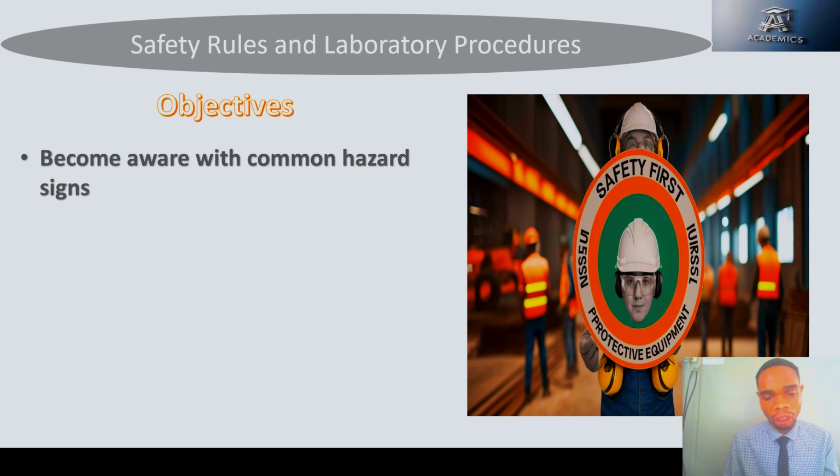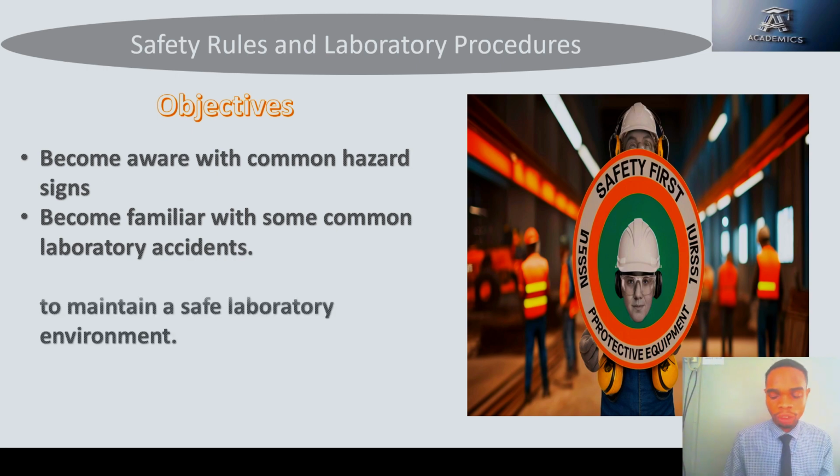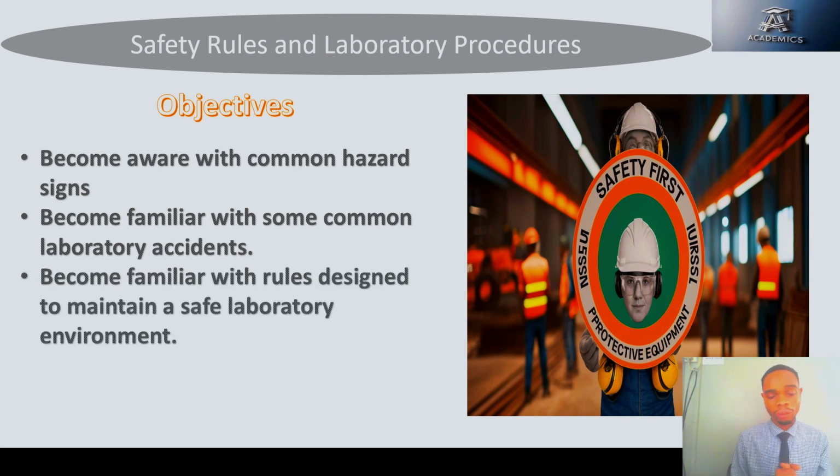So we are going to talk about the hazard signs, and I'm going to show you some of the accidents anyone can experience in the laboratory if someone does not have a good knowledge of the rules that guide operating in the laboratory. We also talk about some of the safety rules designed in order to maintain a safe laboratory environment.